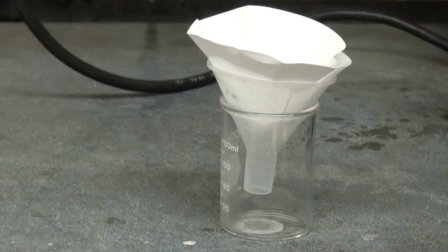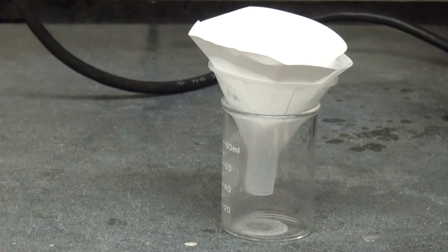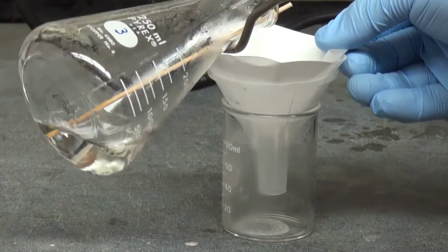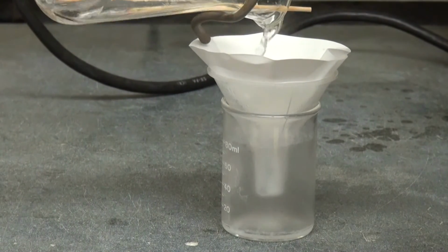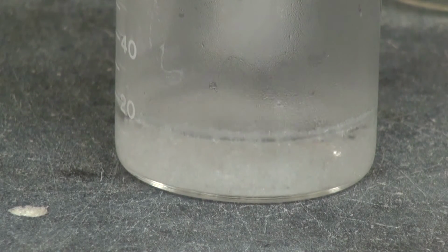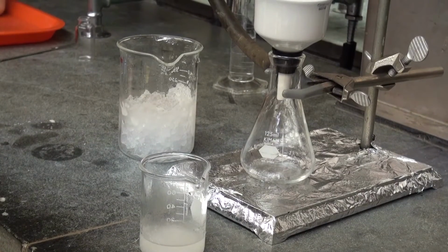Add a couple milliliters of the hot solution to the filter and make sure it goes through. If you see benzoic acid crystals in the filter paper, your solution is either too concentrated or not hot enough. In this case, you should add more water to the solution and heat it until it boils. Now you can add the next couple of milliliters of hot solution. After the filtration, the solution should be allowed to cool to room temperature. You will see the formation of crystals. Don't move the solution during that time and let it cool down to room temperature slowly.